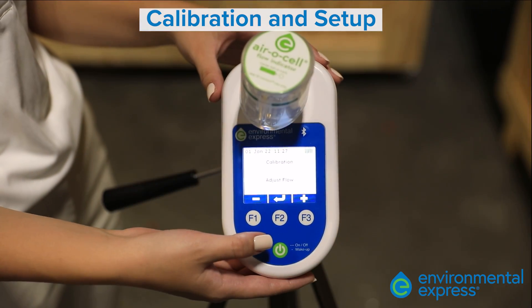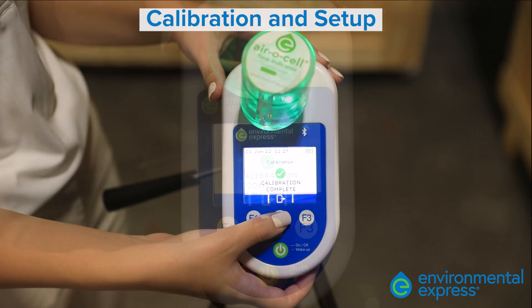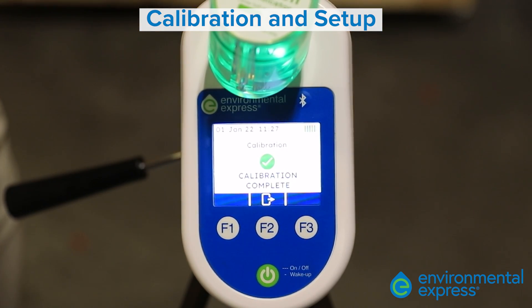When satisfied with the position, select the middle arrow button. The screen will then display calibration complete. Once calibrated to 15 liters per minute — the flow rate required for mold collection — we are ready to begin sampling.